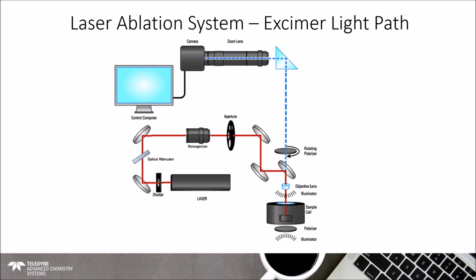The idea, of course, with smaller spot sizes, you get better resolution, especially with sample mapping. But with the larger spots, you're going to get more material and be able to increase sensitivity. So we always tell people, typically, when we're doing our method development, we like to use the smallest spot size that we're able, where we still receive the sensitivity that we need.